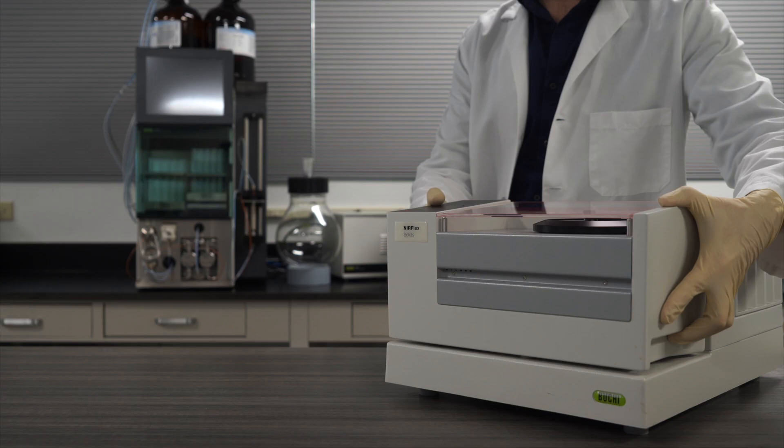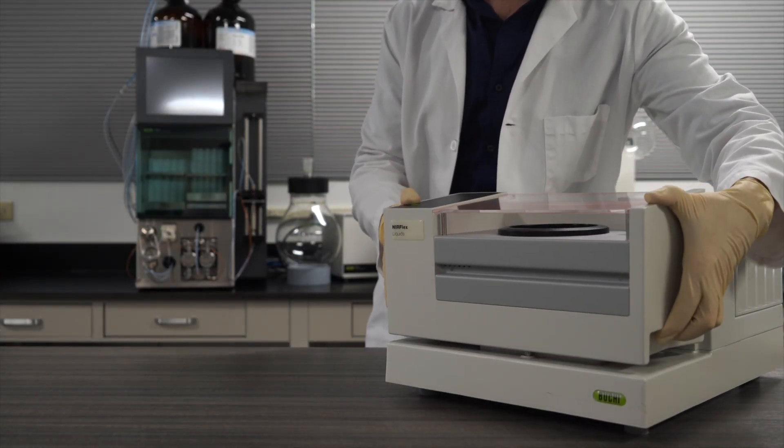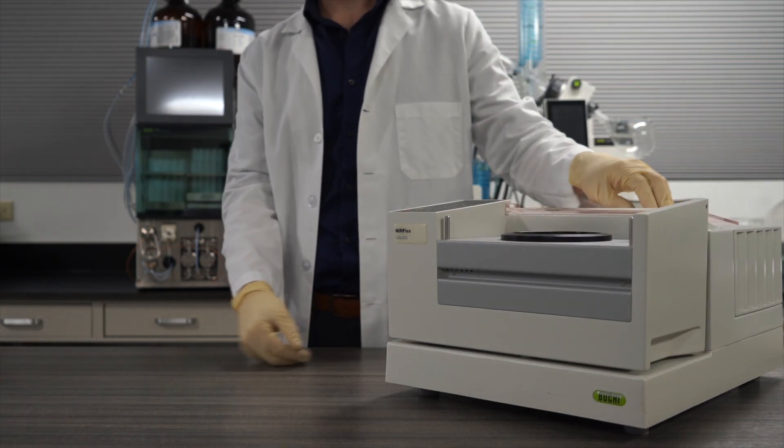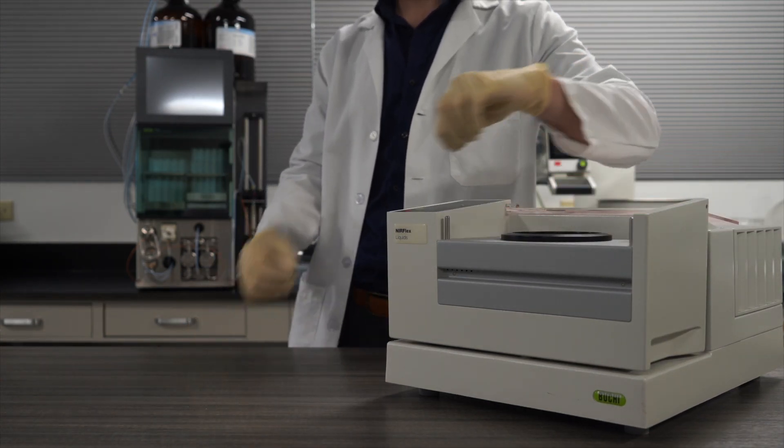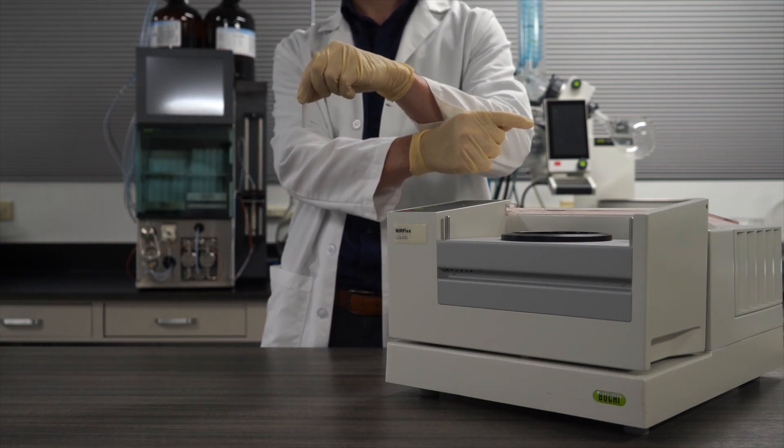While on the topic of liquids, let's hop over to the liquids module, which comes standard with a six position auto-sampler for cuvettes or vials. This liquids module works by the principle of transmission, where we collect light that passes through a sample rather than what's being reflected.